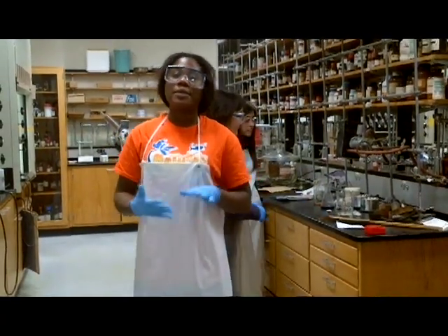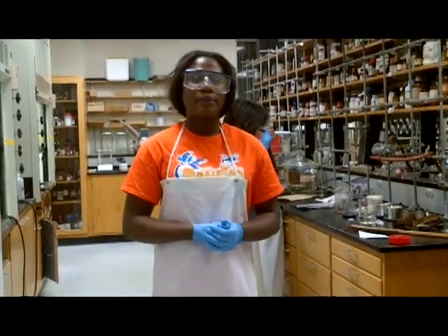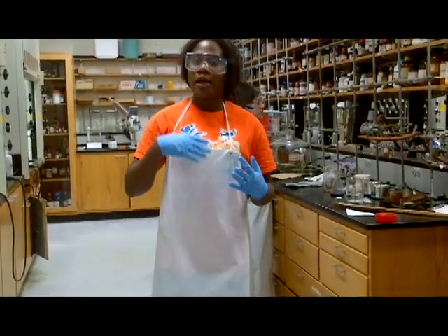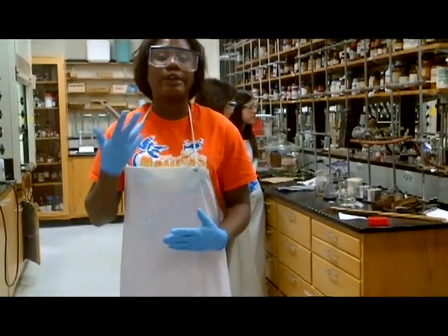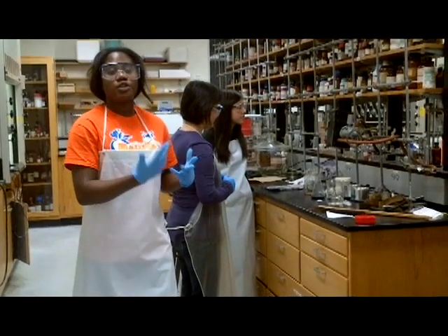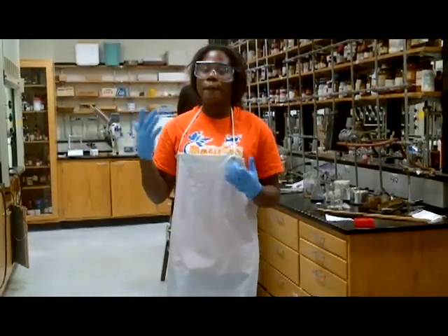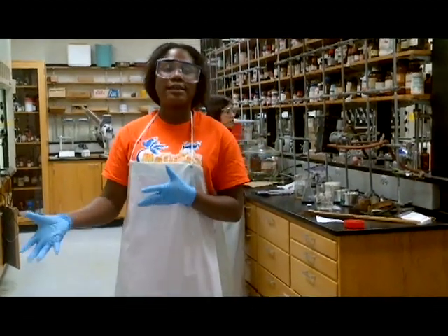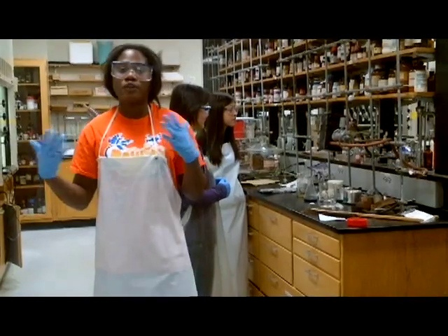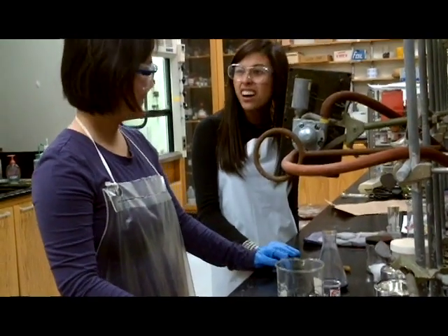So this is part 3 about safety in lab, and this has to do with lab etiquette. One of the 2 most important things in the lab is about food and drinks, which are definitely not allowed in the lab, and the other thing has to do with washing your hands, because you're dealing with so many chemicals, and even through these gloves, chemical substances can get onto your hands, and then you end up touching other people or other parts of your body like your hair or your face, and it can lead to contamination.